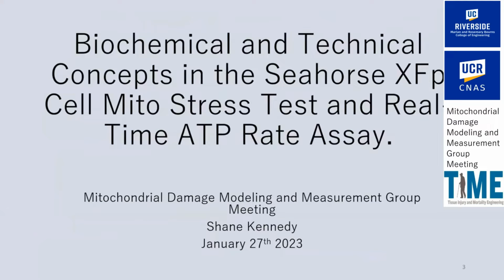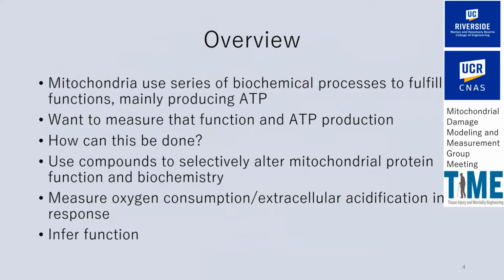Now, getting into the lecture today, the topic is biochemical and technical concepts in the Seahorse XFP cell mito stress test and real-time ATP rate assay. Mitochondria do a lot of things, and we might want to measure their performance and their ATP production. But how can we do this?